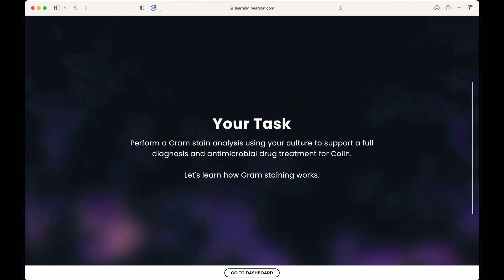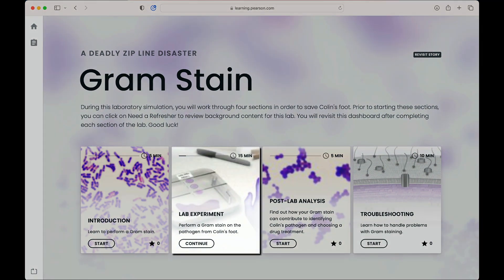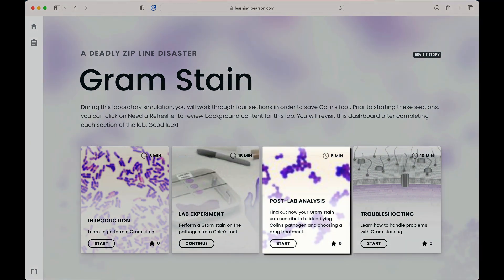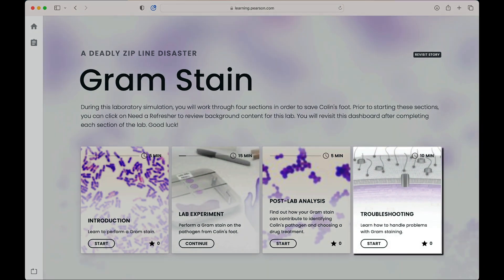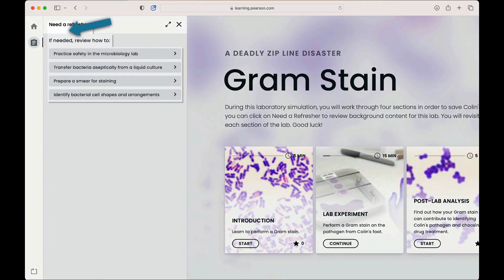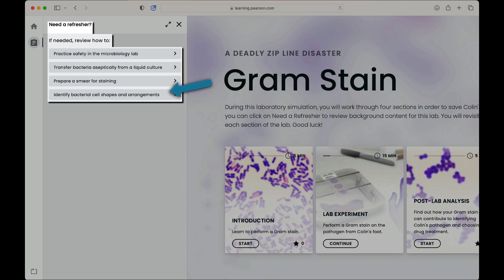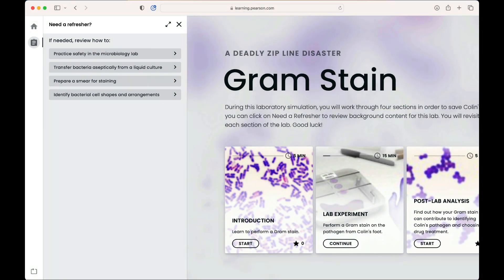After the story, students will enter the lab dashboard, where they will work in sequence through the four sections of the lab, including the introduction, lab experiment, post-lab analysis, and finally the troubleshooting section. The 'Need a Refresher' section is also available in the left-hand navigation. Students can access this area at any time from the lab dashboard to review topics required to complete the lab experiment.